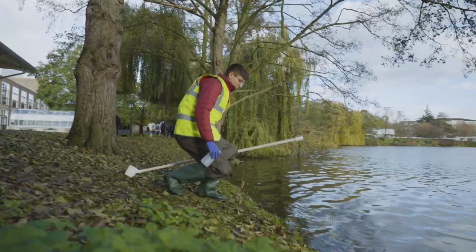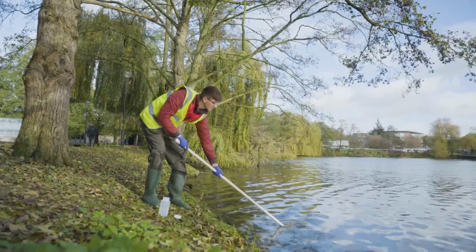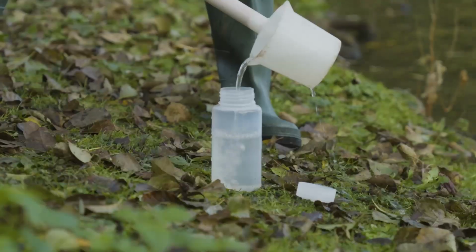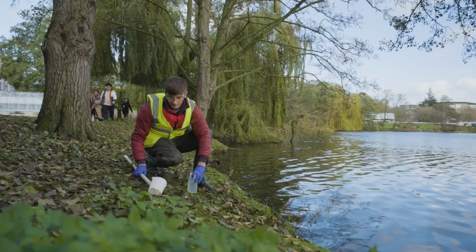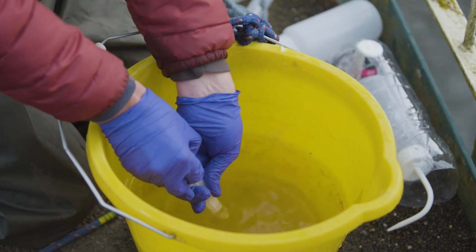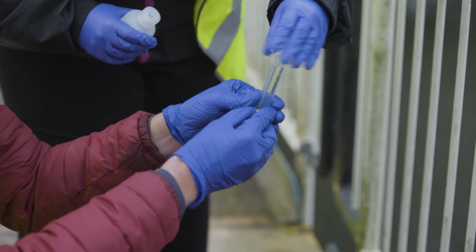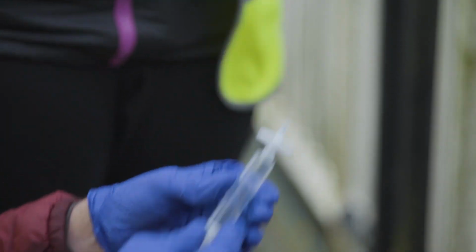Alternatively, you may want to use a beaker on a stick. While not ideal, this method can be used to take samples from the bank if you're unable to access the center of the water body. Once collected, you may need to filter the water with a syringe filter if it contains suspended material such as sediment, leaves or other debris, or depending on the analysis you have planned.